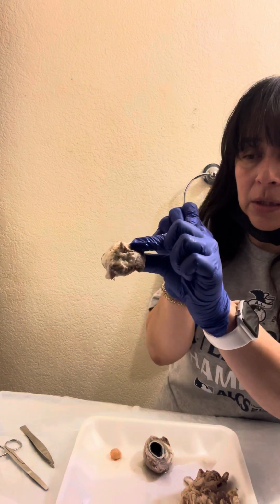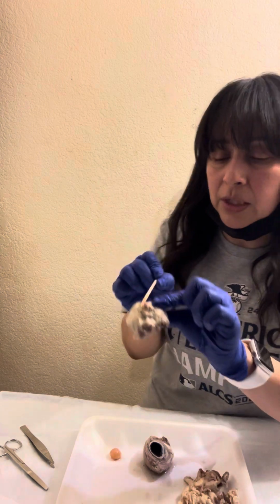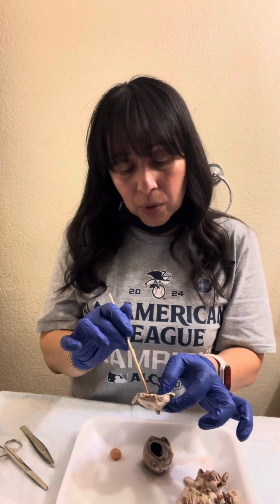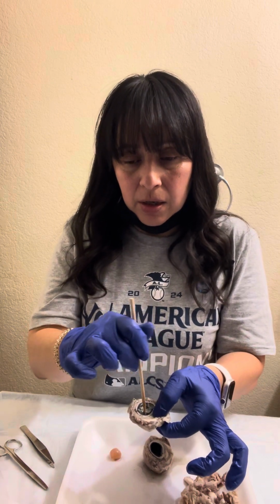And then in the posterior part of the eye, we have the optic nerve, and you can kind of see it there. It's like sticking up right there. So that's the optic nerve, and that's the second cranial nerve, and that's responsible for visual sensation. We have the optic disc, which is where the optic nerve and the retina meet. So kind of like in there.